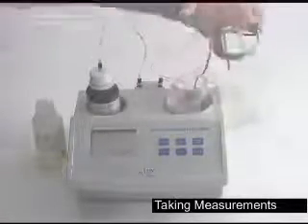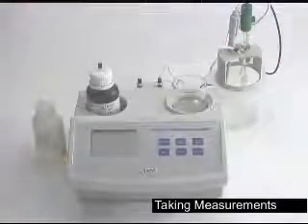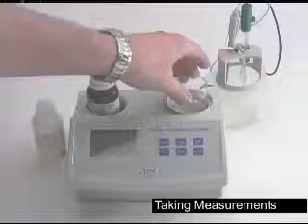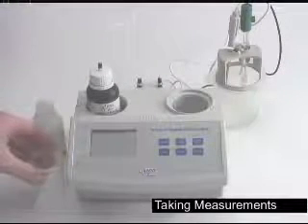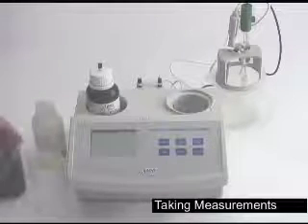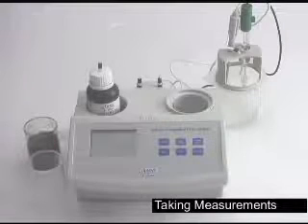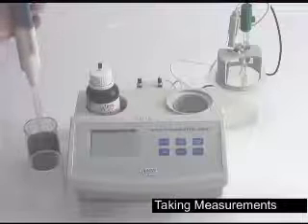Remove your cap. Always rinsing your probes in between each test. Again, take a clean beaker and some wine to be tested. Same as using the standard, we're going to take 2 milliliters of the wine.